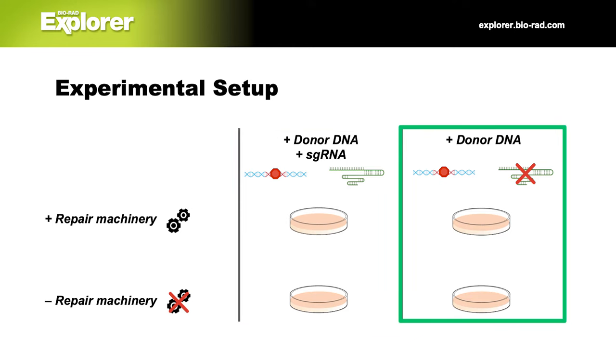Now it's time to add our different plasmids. Remember, we'll be adding one of each plasmid to the bacteria from each starter plate. We'll start with the PD plasmid, which we'll add to tubes A and C. Set your micropipette to 10 microliters and add a tip.